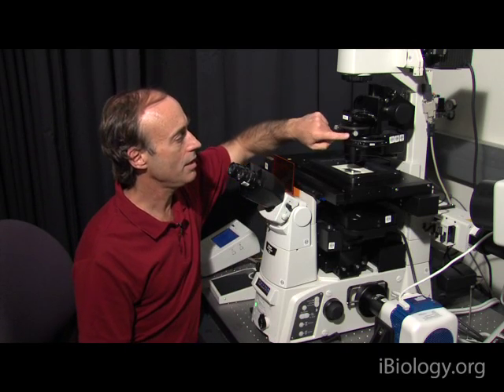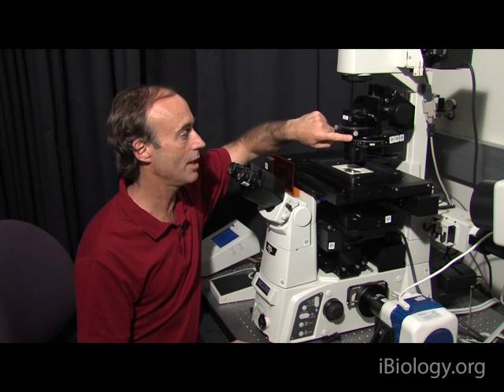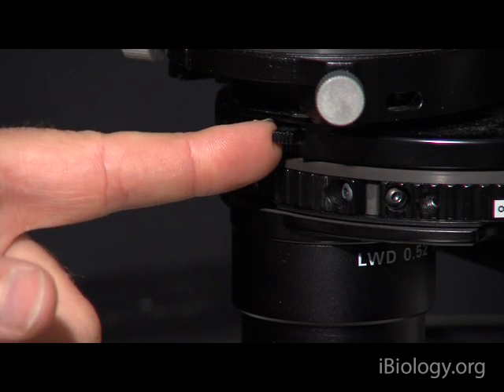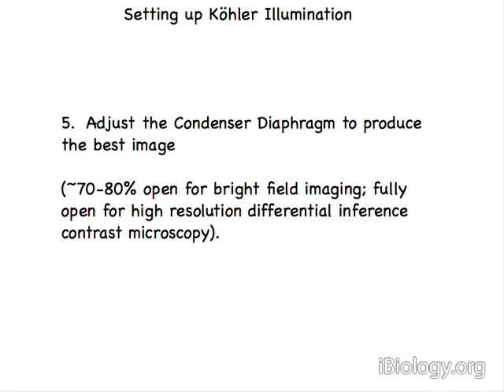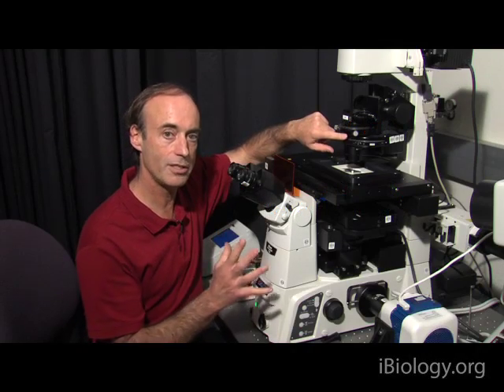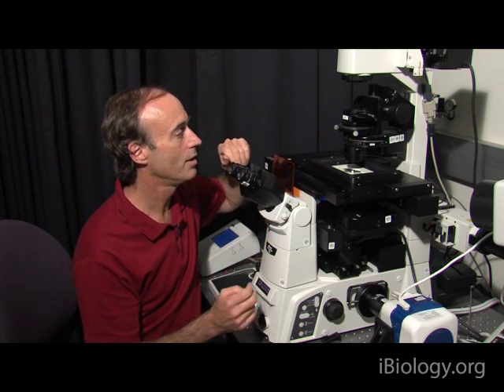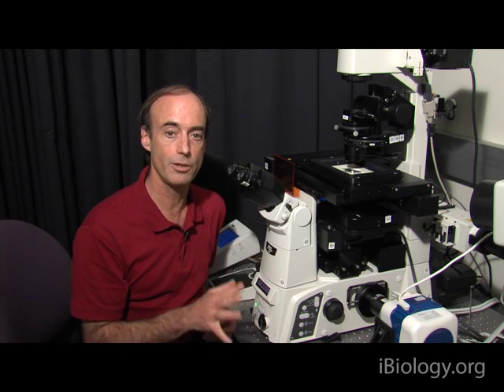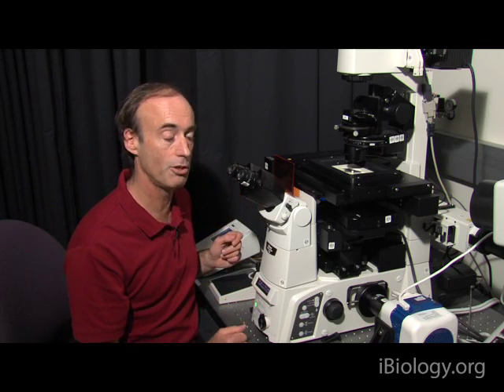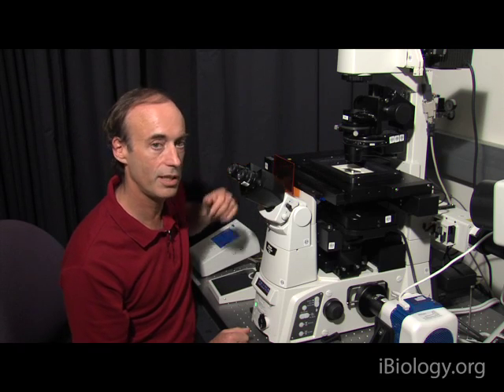The last adjustment we may want to make is to change the opening of the condenser aperture. There's an iris here that can open and close. In bright field illumination, we may want to have this open about three quarters of the full opening, and we can adjust it based upon how the image looks. Opening and closing the condenser affects both the resolution and contrast of the image, so we adjust that to get the right kind of image of the specimen. In other types of microscopy, like high-resolution differential interference contrast microscopy where we use computer enhancement of contrast, we may want to put the condenser fully open.